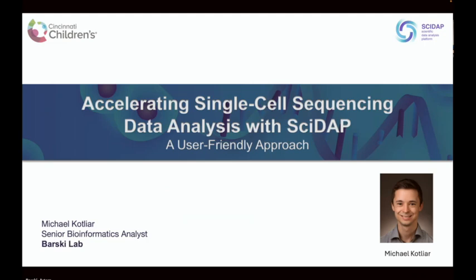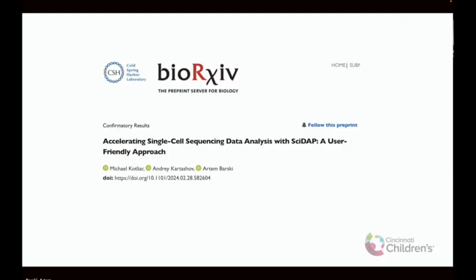Okay, so these are pipelines developed by Michael, and he also developed nice videos, which I will be showing in the presentation. I wouldn't need to go into the platform itself for the sake of time. This manual is currently on bioRxiv, and it will be published in the Methods in Molecular Biology book series in a few months.